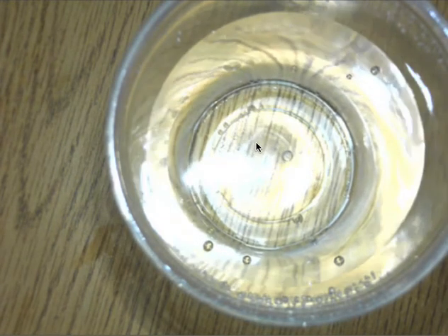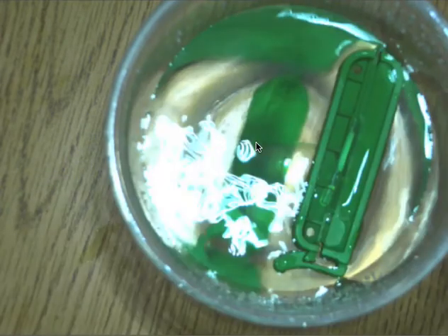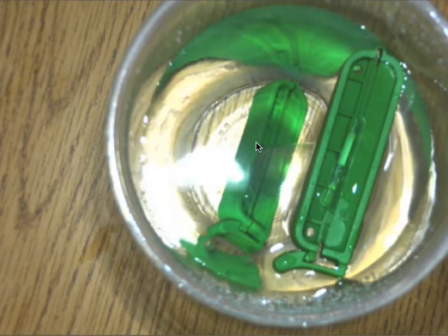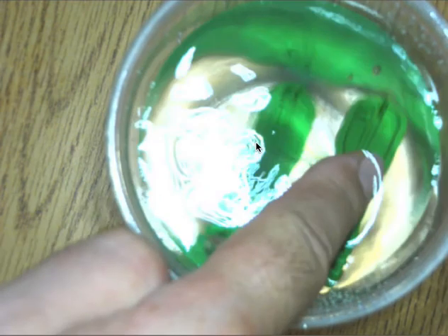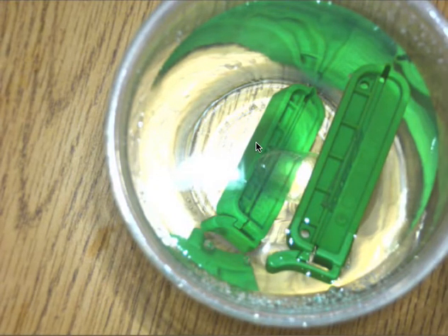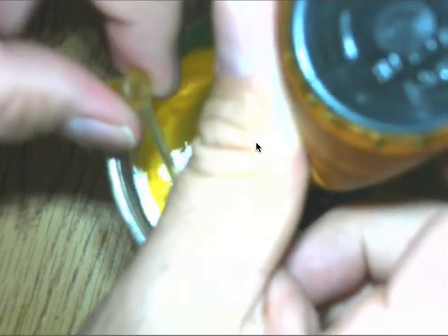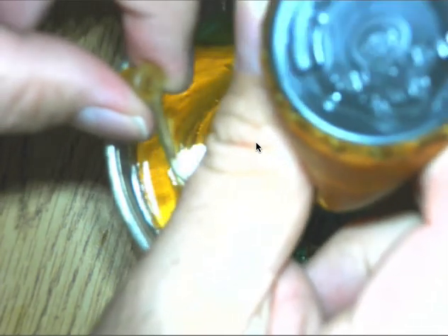So we're going to take our tubing, place it in the tap water so that it submerges. Add just a little bit more. There we go. Add a little more tap water. So now it should be completely submerged. Excellent. Now it says add about 20 drops of iodine solution in the water in the plastic cup. Record initial observations in data table 1. So we'll add about 20 drops here. 1, 2, 3, 4, 5, 6, 7, 8, 9, 10, 11, 12, 18, 19, and 20.